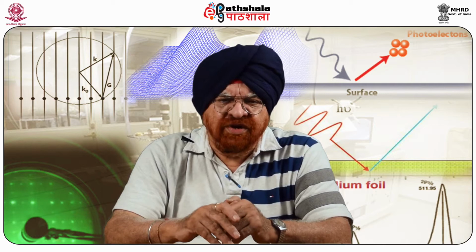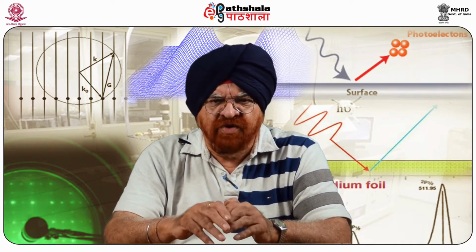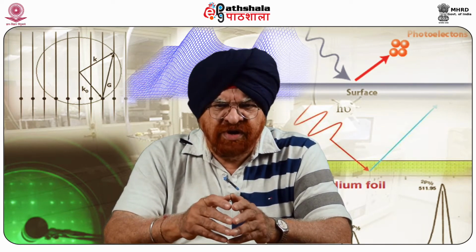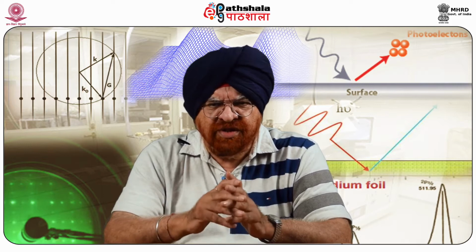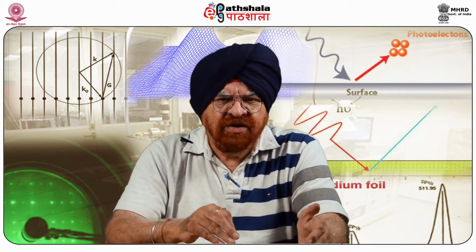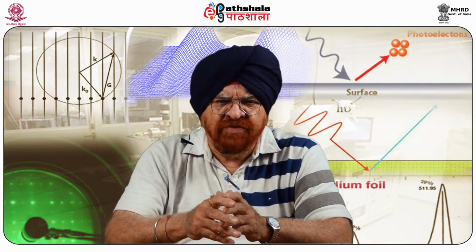Elemental identification and quantification of any element from lithium to uranium can be done using ESCA. I had said that the usefulness of this spectroscopy is that it can detect elements from very light ones like lithium to very heavy elements like uranium with great ease.